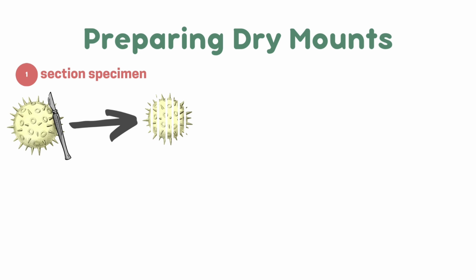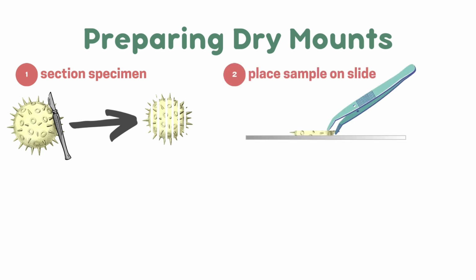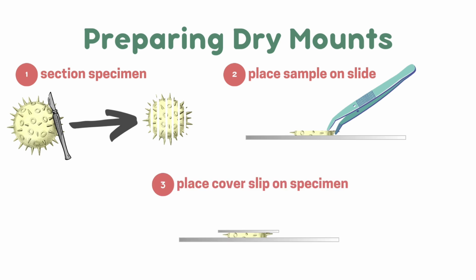First, you section your specimen into thin slices, either using a scalpel or a special machine. This is so adequate amounts of light can pass through the sample. Using tweezers, you then place the sample on a slide. You then place a cover slip on the specimen, and that's it.